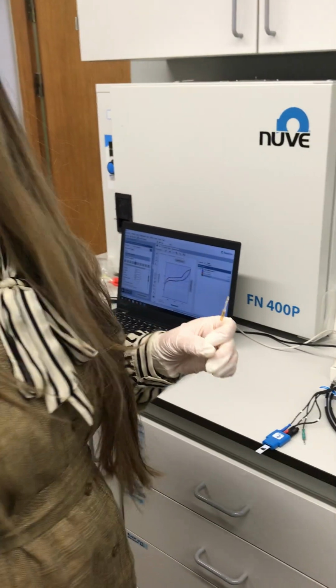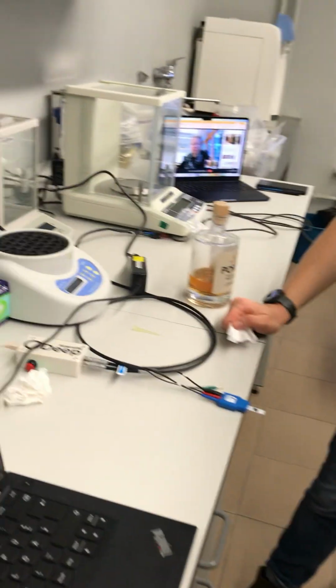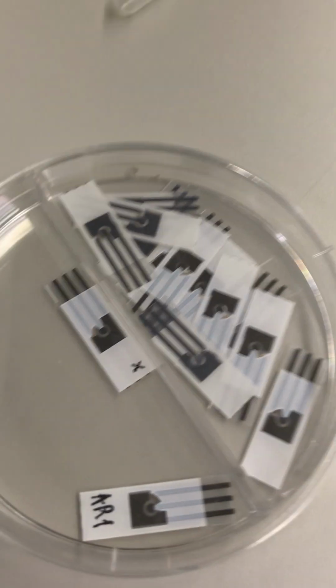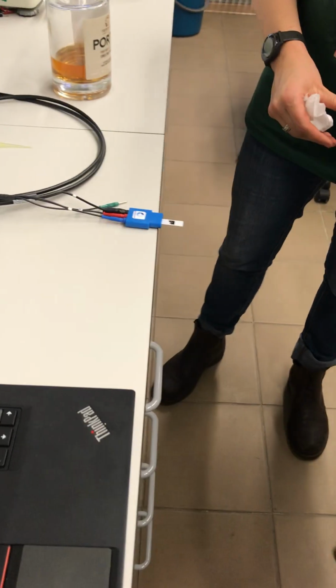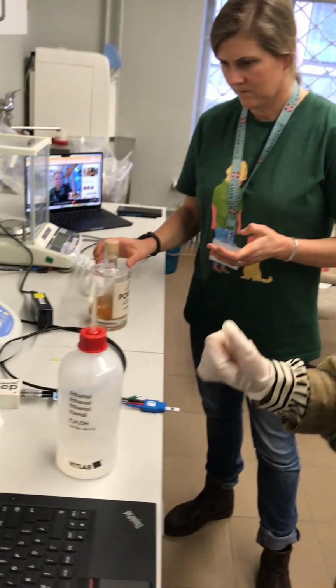I need a bit of ethanol just to clean it, to make sure it's not contaminated from there. Someone was giving me a hand with the ethanol. So when do you put the ethanol? Before it evaporates? I need to clean a bit here and I have to be careful that the ethanol doesn't come into contact with the electrodes.